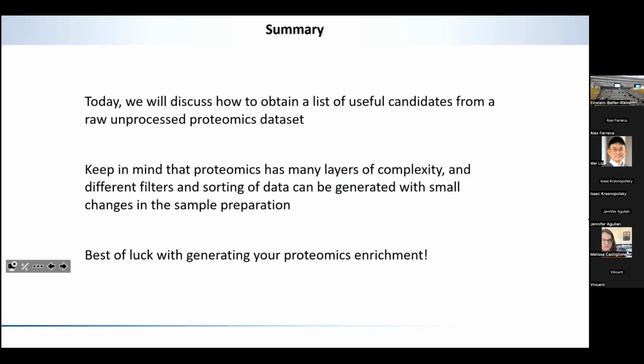Yeah, actually, that's a very good question. And I think we partially address it with the way that we're going to process the data today. So the issue with filtering is always that there is no weight on which features seem to be the most enriched. Right? So you're right. If we filter for two-fold and p-value 0.05, you end up with 500 proteins. What do I do with that? Now within those 500 proteins, some of them are vastly more regulated than others. Still, all of these 500 proteins contain information.